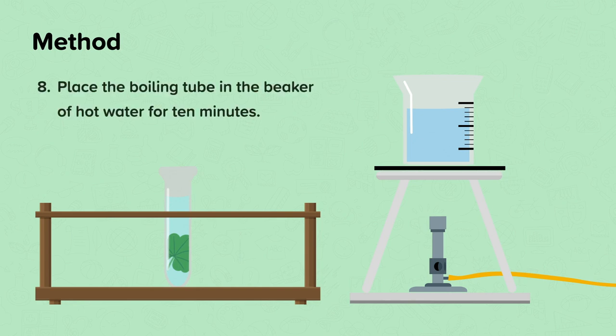Step eight, place the boiling tube in the beaker of hot water for 10 minutes. You'll notice that the ethanol will start to boil. Chlorophyll is soluble in ethanol, so as the ethanol starts to boil, it will allow it to remove the chlorophyll from the leaf more quickly. After 10 minutes, the leaf will be almost white and the ethanol will have turned green from all the chlorophyll.